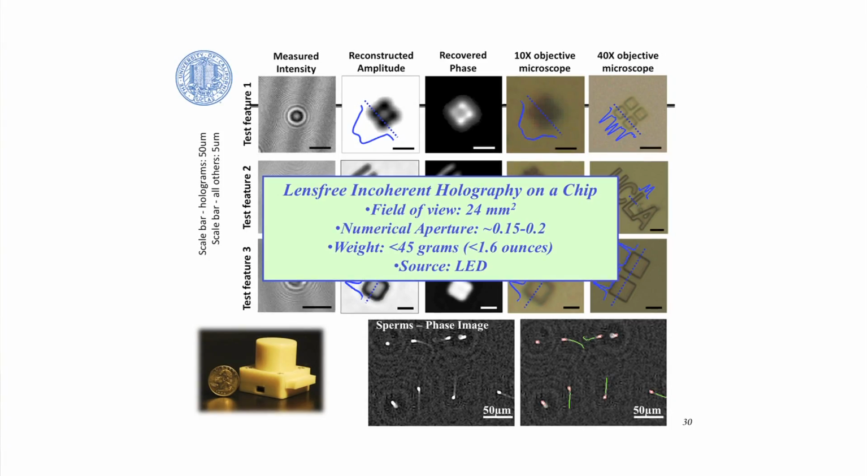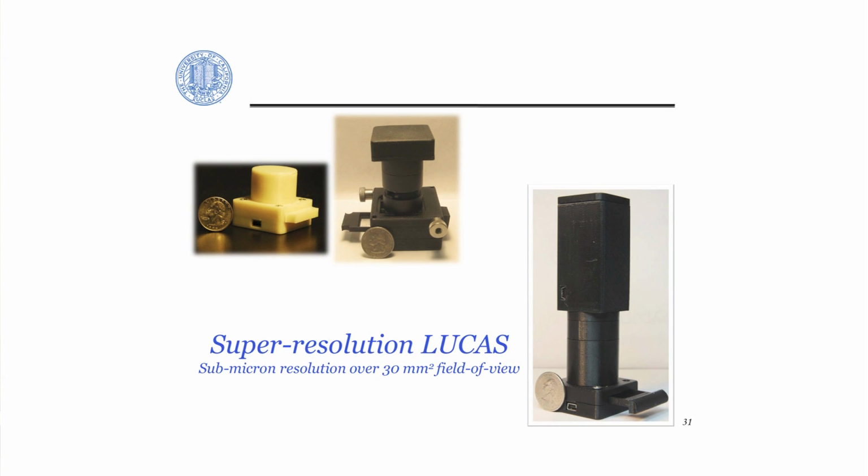Now, in the next few slides, I'd like to go over some more technology that is going to keep this field of view as competitive as it is, scaling linearly with the active area of the sensor. However, increase the resolution and the numerical aperture so that we are now more competitive for the resolution, deeply submicron. So for that, we've complicated the design, but still very cost-effective and lightweight.